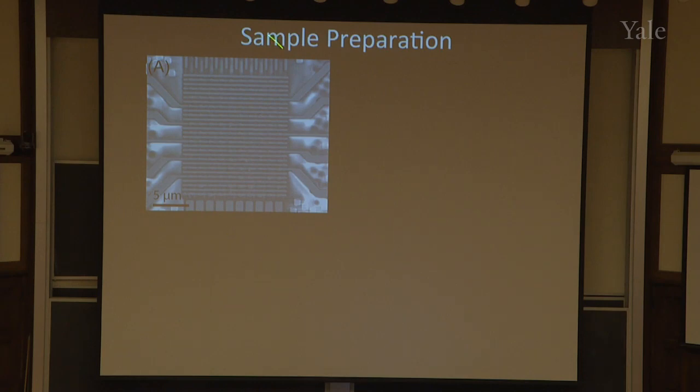Now, there's actually a little bit of work that one needs to do. So here is actually the device that IBM gives me. It's a wafer. It's got thousands of these little chips in it. Okay? So I cannot just put this into the TEM, actually. So I have to do some steps. Now, the engineer at IBM tells me, you should look at this particular device. That device was interesting. So then I say, oh, OK.